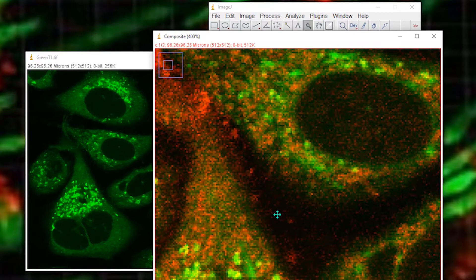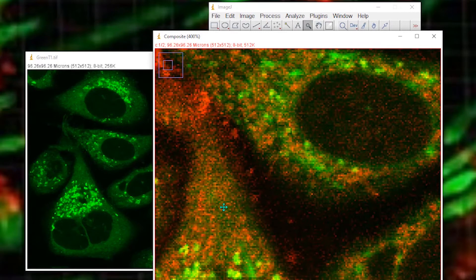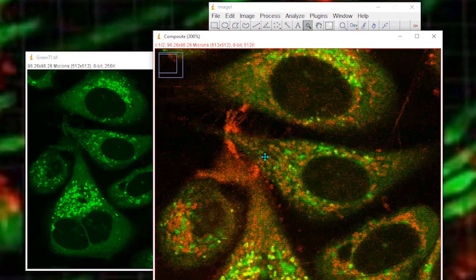And if the green channel was also noisy, then you would get some stray co-localization. You could, of course, measure co-localization under a threshold, which is also described in the previous video. But that noise would still contribute to the co-localization measure. So how can we account for that?